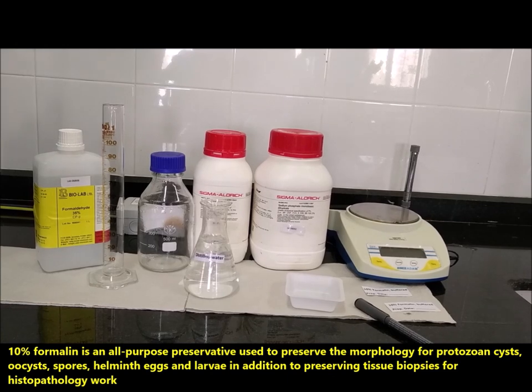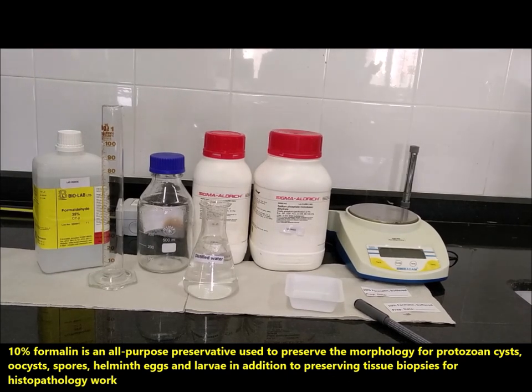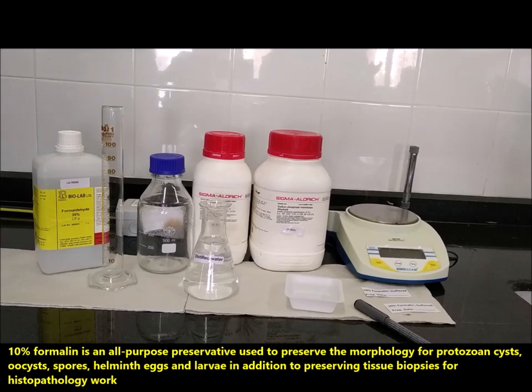10% formalin is an all-purpose preservative used to preserve the morphology of protozoan cysts, oocysts, spores, helminth eggs, and larvae, in addition to preserving tissue biopsies for histopathology work.